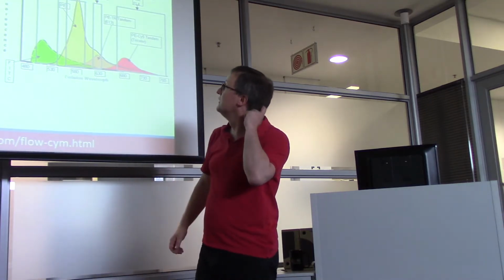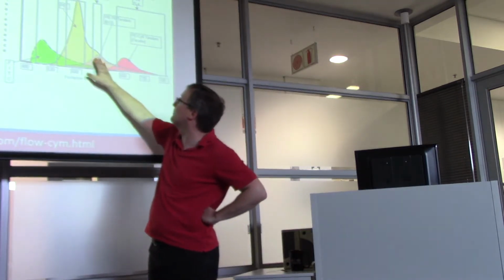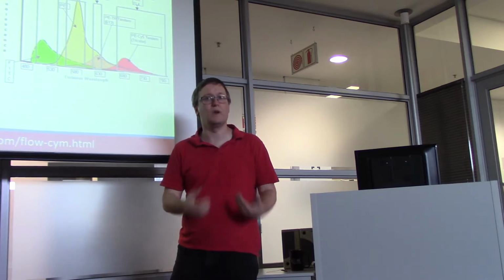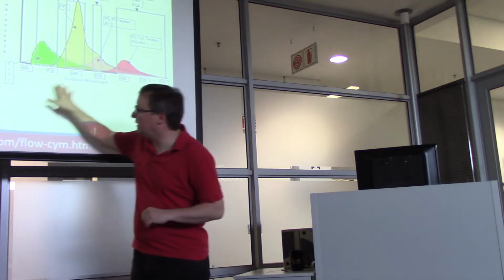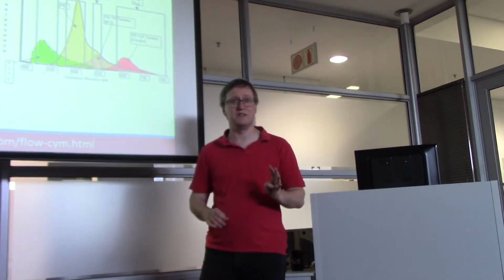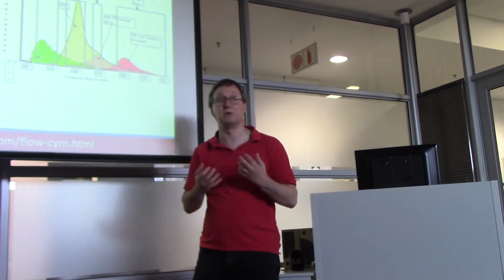Oh, here it is, yes. So if you imagine that we have these four dyes in operation, we need to be able to subtract out how much the yellow is contributing to our orange signal in order to be able to make an accurate quantitation of how much orange there really is. So in this case, I'm showing 4 dyes, but there are instruments that can measure far more dyes than just 4 in a single one of these. Being able to discriminate them from each other, being able to adjust for a very loud signal at a neighboring wavelength is something that we frequently must do.